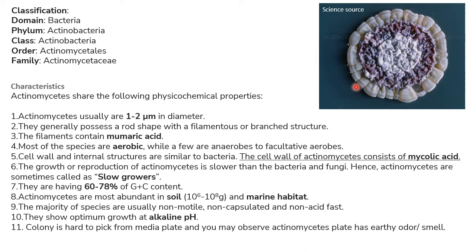That is the case with actinomycetes, but in the case of fungi you can easily lift up the colony by using your forceps or loop, but not in the case of actinomycetes. So that's the differential point which you should remember when you are studying actinomycetes.